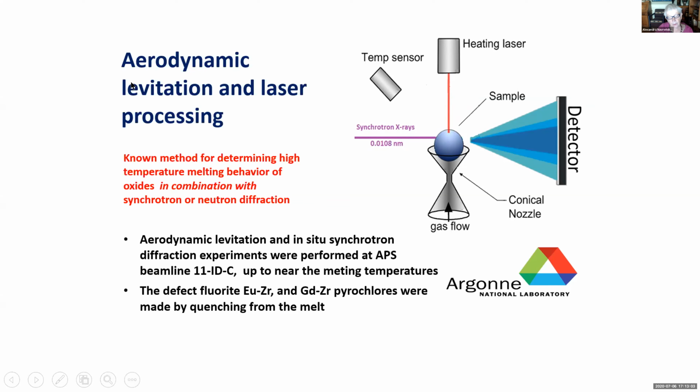And it is also an excellent way of preparing samples, because then one can very rapidly cool the small bead of material and sometimes get metastable phases that you cannot otherwise get. For example, in the silicates, it's a way of preparing olivine composition, Mg2SiO4 composition, as a glass, which is not otherwise accessible.